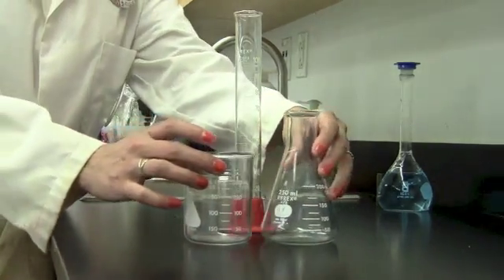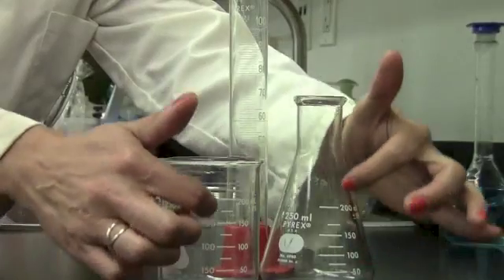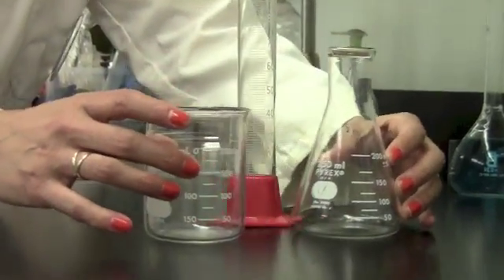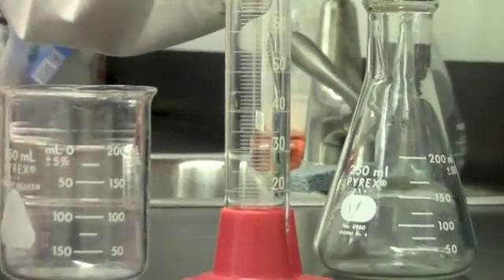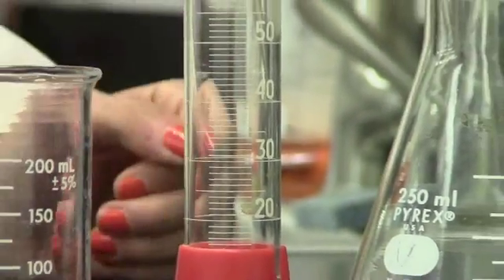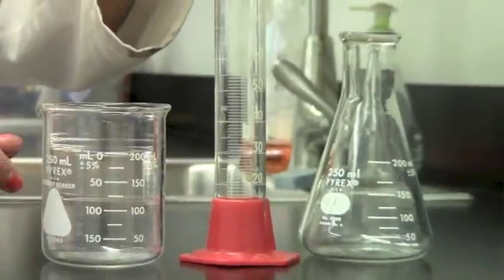Notice that beakers and flasks have very few volume markings on them, whereas the graduated cylinder has a whole lot of volume markings on it. To measure a liquid, I'm going to use the graduated cylinder.